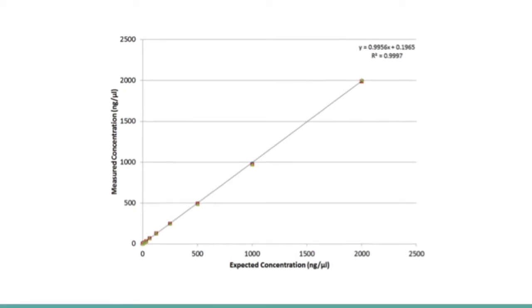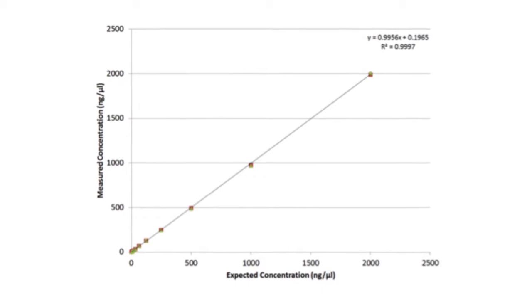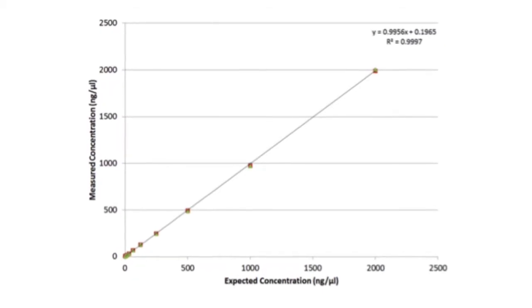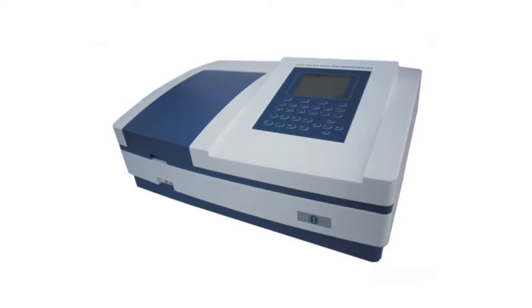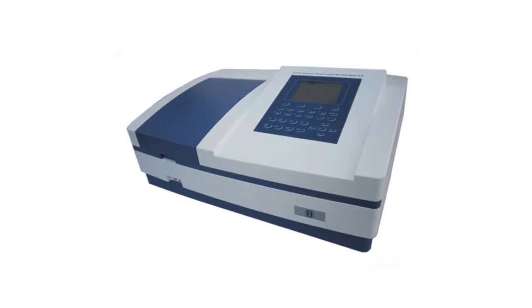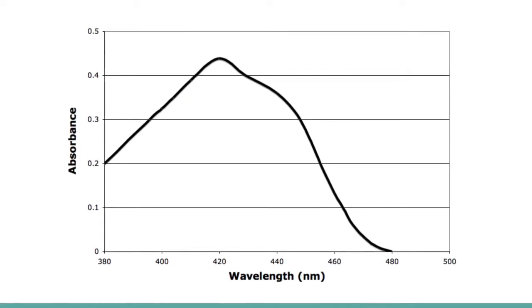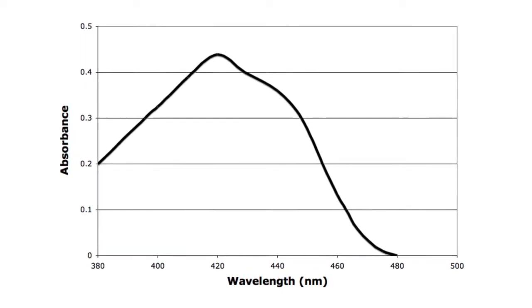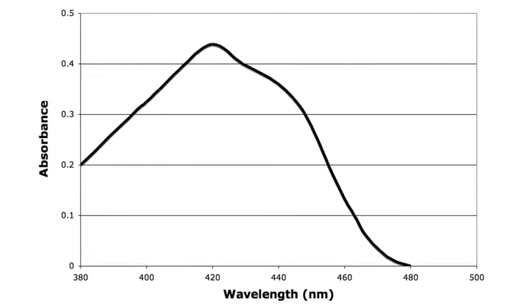After isolation and purification of nucleic acids, it is necessary to quantify their concentration in the sample. Among the quantification methods, we can find the following. Use of UV spectrophotometry at 260 nanometers to determine the concentration of DNA in the sample. Another measurement will be needed at 280 nanometers to get the A260/A280 ratio, which determines protein contamination in the sample.